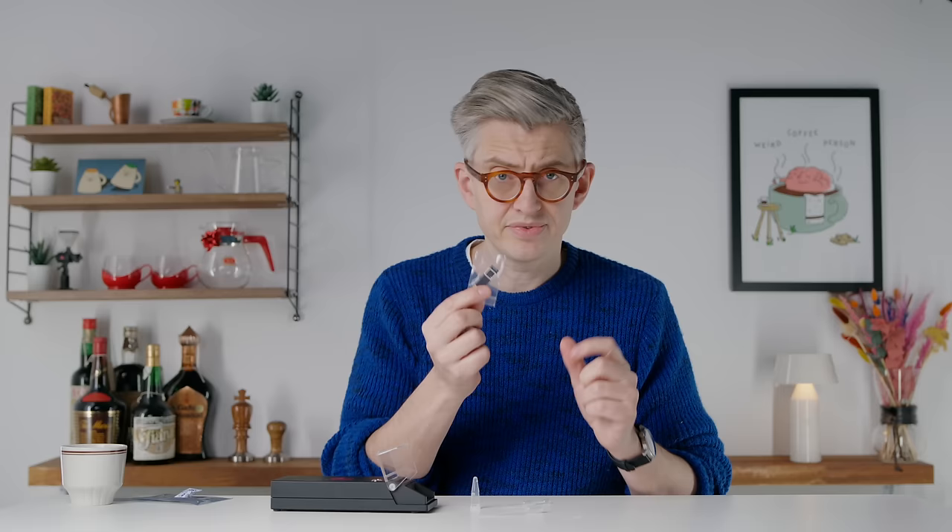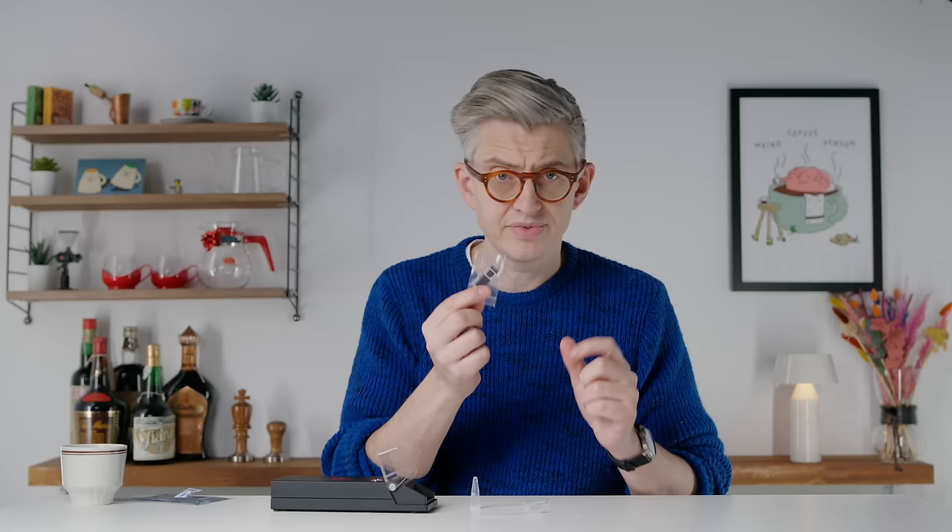This is it. I know it doesn't look like $2,500 and it doesn't look very exciting, but I promise you it is. The way it works is kind of annoying, if we're honest. Each test requires a pack of reagent — there's a chip, some pipettes, and some reagent. The chip is what you insert into the machine, and all of this is single usage. You can't reuse a chip, you can't reuse a reagent. Each single test requires this kit, and this kit costs £7.50 per test, which is wasteful and expensive. So I had to make sure to make every test count, which we did.